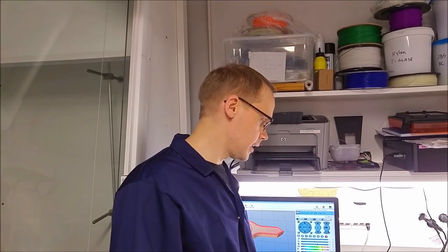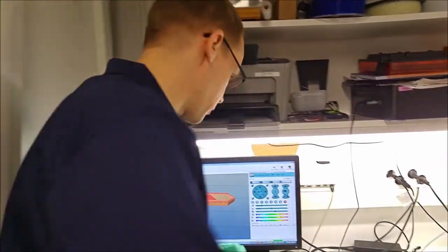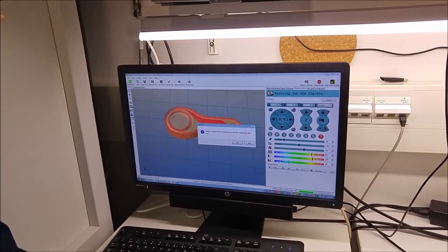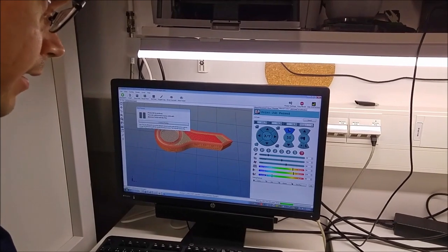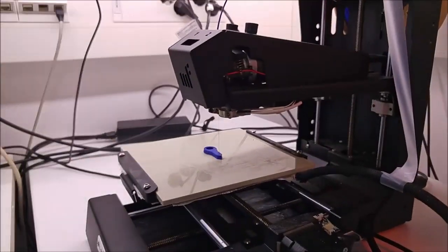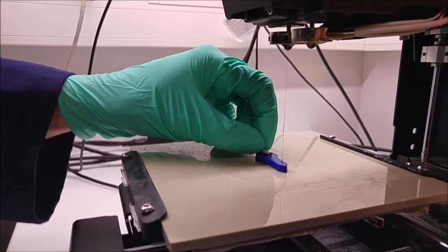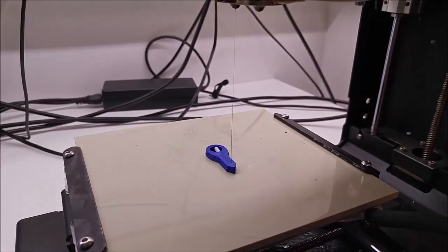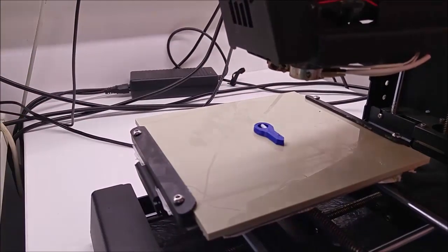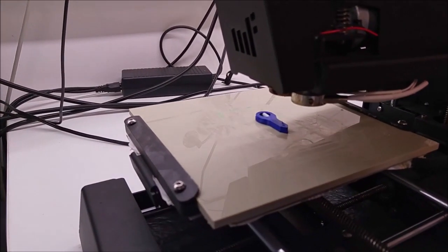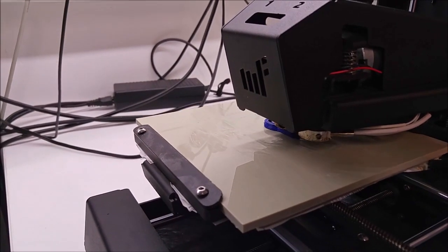One of the advantages of FDM printing is that we can interrupt the printing process at any time. Right now we will insert the stir bar into our micro mixer. I will pause the printing from here. Then I will raise the print head 10 cm from the platform, insert the stir bar into the chamber and continue printing. And we inserted the nanospray needle exactly like this also.